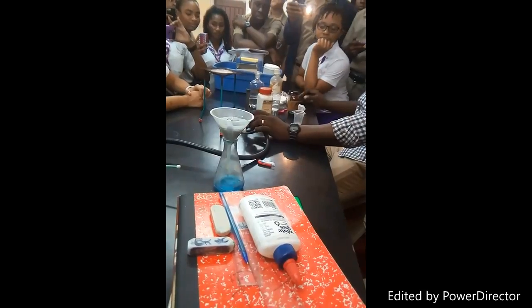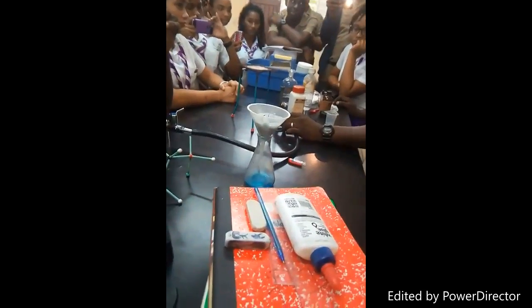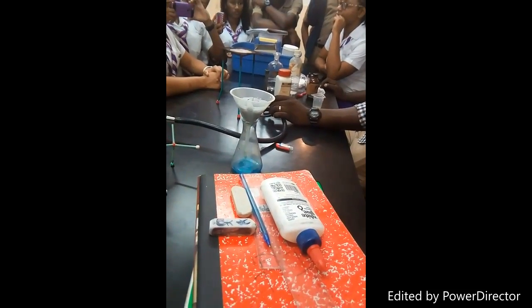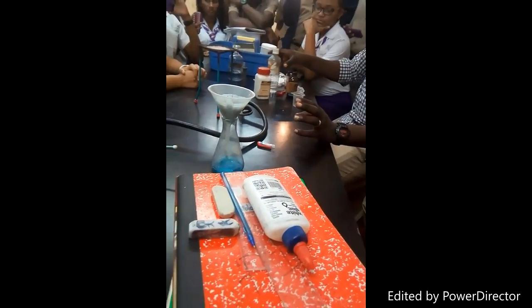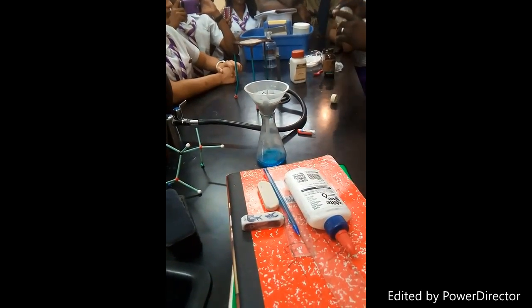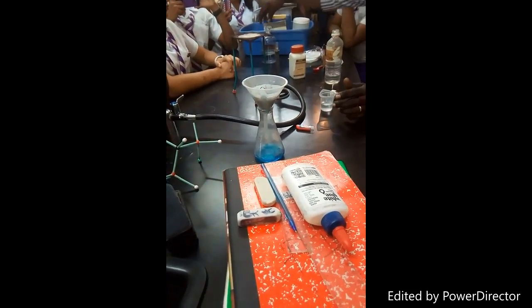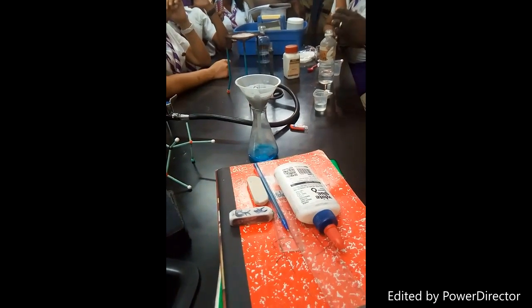How do we make insoluble salts? Ionic precipitation. What is ionic precipitation again? When you mix two soluble salts, you form one soluble and one insoluble salt. So we are going to mix lead nitrate, which is this substance. Let me pour it out for you to see that it's a liquid. Lead nitrate plus potassium iodide, KI.